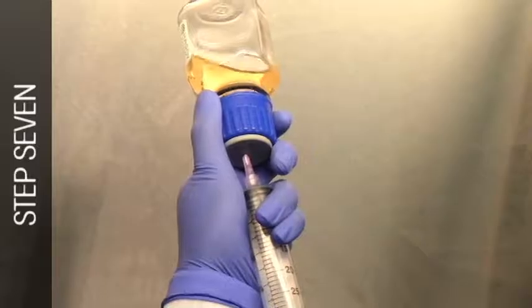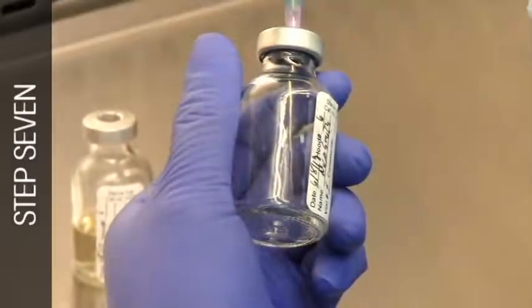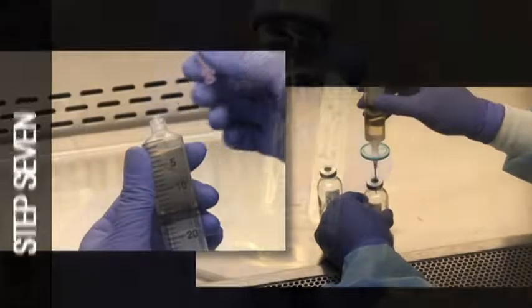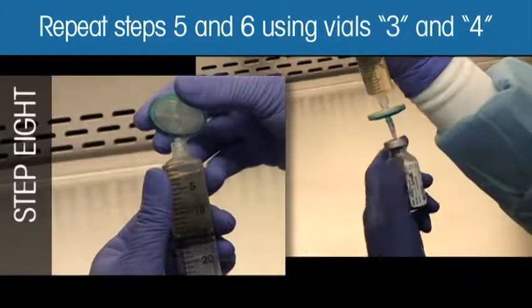Withdraw another 25 ml of the non-sterile tryptic soy broth. Transfer 5 ml of the broth to the vial labeled Control-2. Repeat steps 5 and 6 using vials 3 and 4.